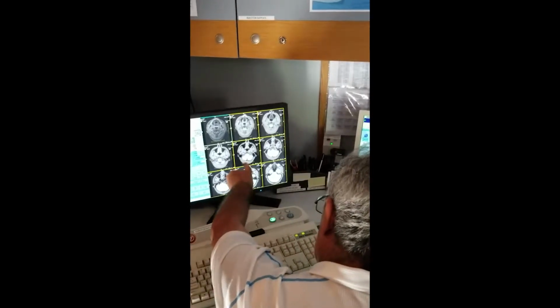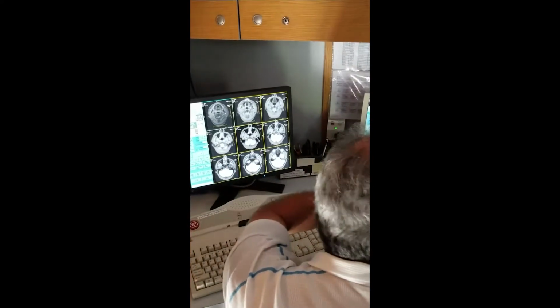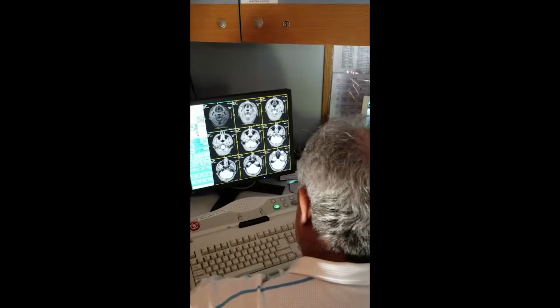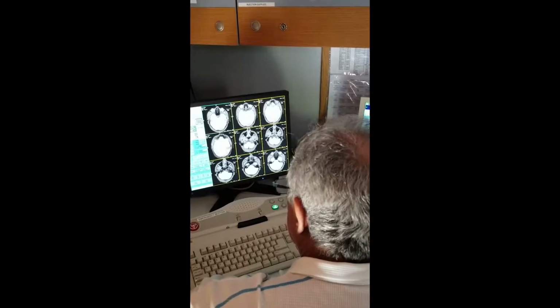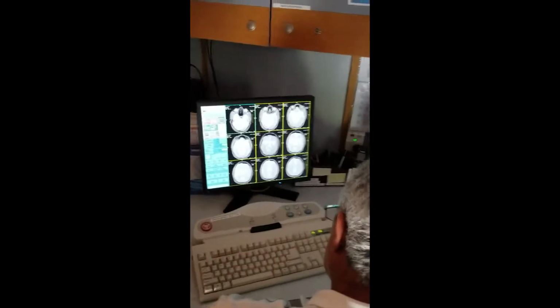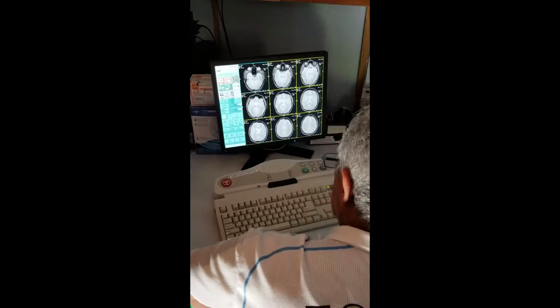And then you want to do it like that. You like this image or this image better? The middle. Mine, right? Yes. This is a little contrast matching. And it's a little too bright, right? So then they all change. Next set of images, next. So then you adjust. You may have to adjust a little bit. You see these are white and gray matter? It's a little too bright. Okay? I say next set of images.